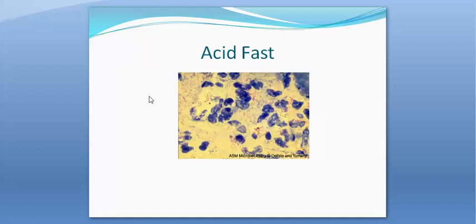Here is a sputum sample that demonstrates acid-fast bacteria in the red, in the background of cellular debris from a sputum. This would be typically done for patients suspected of having tuberculosis, taking sputum samples to look for evidence using acid-fast staining techniques.